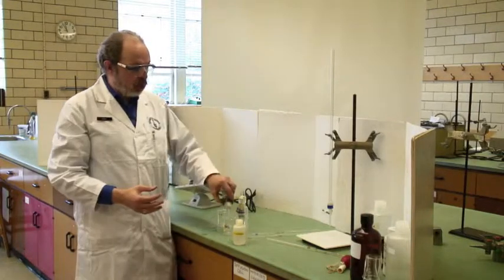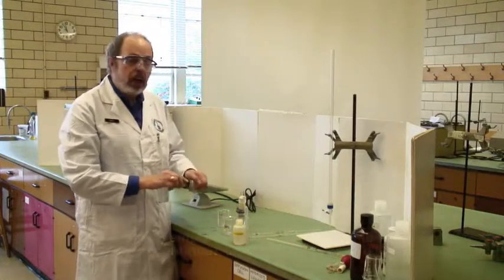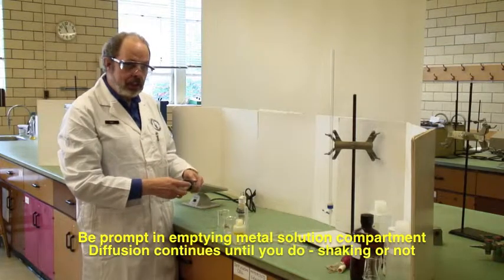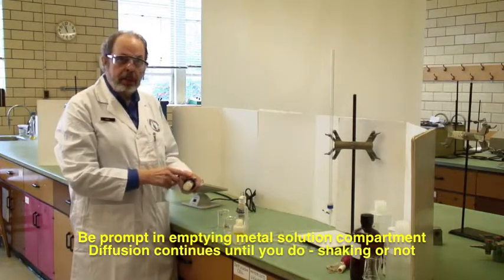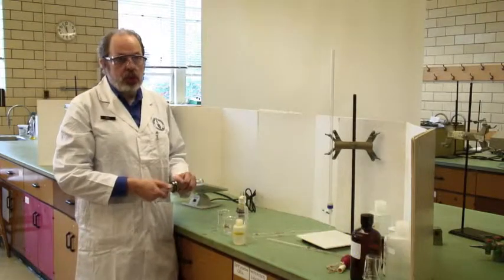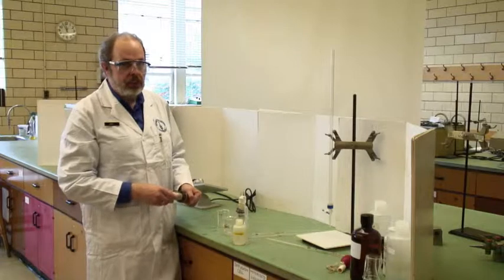And pour the contents of the metal cell, which will have some acid into it, as soon as you can. Because even though it's not on the agitation device, diffusion is still happening. So you need to stop that process as close to the time of five minutes or seven minutes, or whatever it is, as you can.